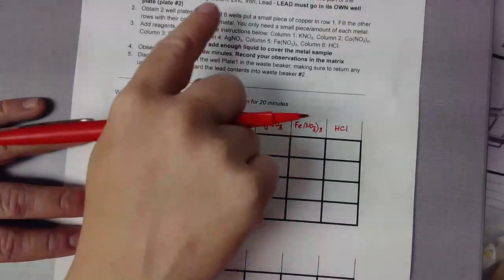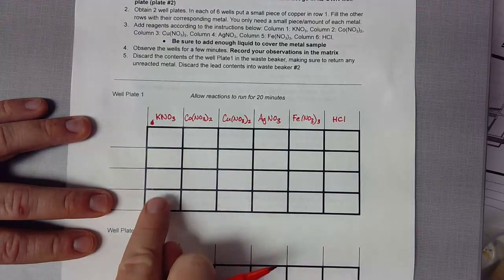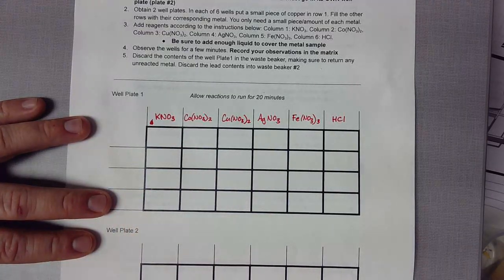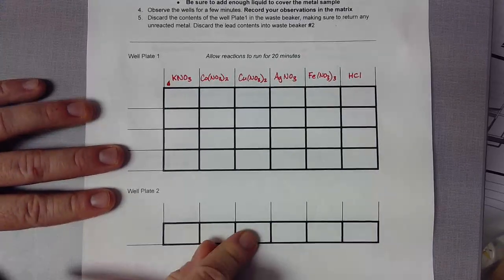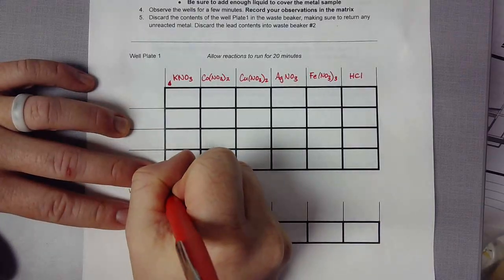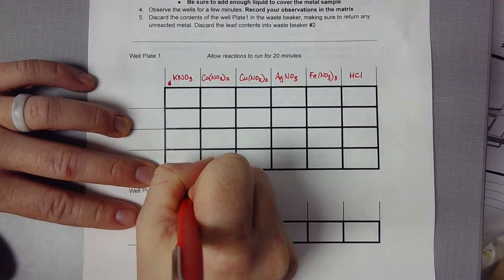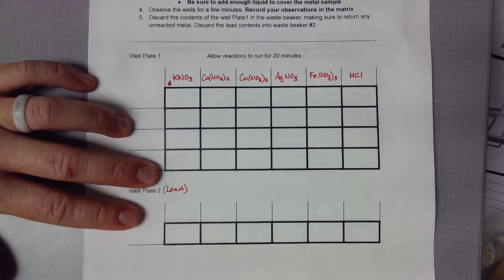Now, written at the top of a column means these chemicals are going to fill down. So along column 1, you will fill all of these wells halfway with potassium nitrate. Now, you're going to have 2 well plates because well plate number 2 is going to contain lead, which has some special disposal instructions which you should know about.